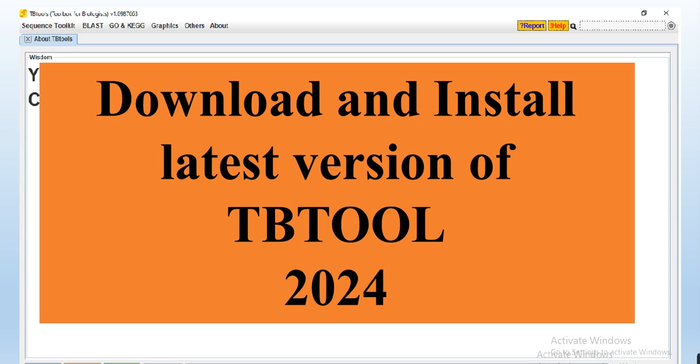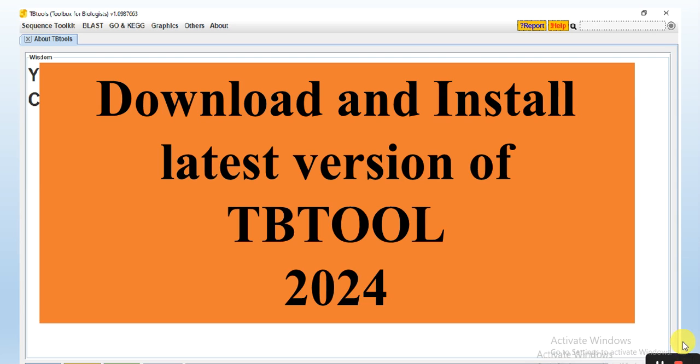I have already made a video on how to download and install the latest version of TBtools, but some viewers are facing difficulties because due to the advancement and modification of the website, they are unable to download or find TBtools. So in this video, I will tell you how you can download and install the latest version of TBtools in 2024 with the modified website. Let's start.